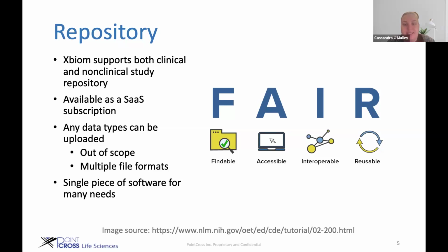With this upload, it doesn't matter if you have a programming staff, SAS viewer, or other resources you might have thought were necessary. All of your data can be accessed through this repository and visualized in this one program. Your Send dataset is integrated into both an XPT reader and a visualization system. Your report is a single click away for your reference, and all of your TFLs for your report or internal reporting needs are pre-templated for you with the ability to auto-update if you ever receive new data.